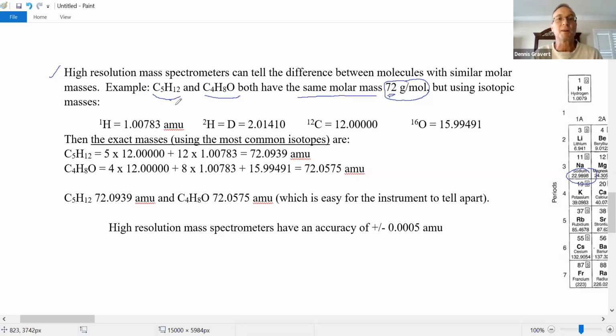Maybe it's one of these two molecules. Okay, not so useful because these molecules are not individual molecules. There's lots of isomers, lots of different ways you connect these together. But you can get more data if you analyze the same unknown compound, not through osmosis or boiling point elevation to get the molar mass, but put it in a mass spectrometer, and more importantly, a high resolution mass spectrometer.